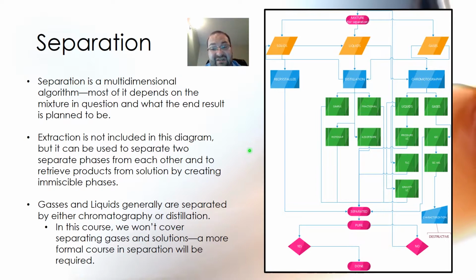Most of it's done at low pressure a lot of the time, but that doesn't mean high pressure is not necessary. Sometimes you have a column you need that for, so you have to have special setups for that. A lot of times the instrumental readings for your retention times are built into the instruments, so we just don't have that kind of setup here to work with you. But we do have some GC results that we'll have you work through eventually, and that'll be coming up in a couple of experiments. We're not quite there yet.